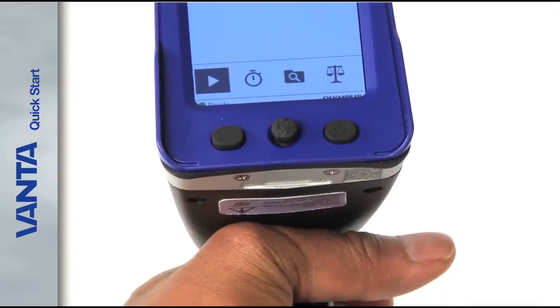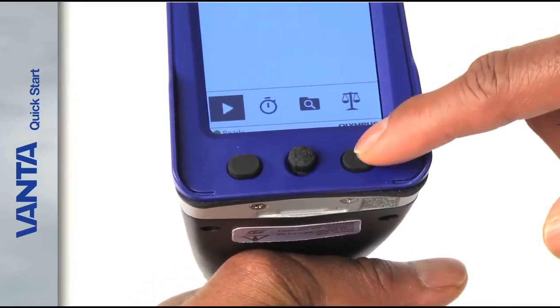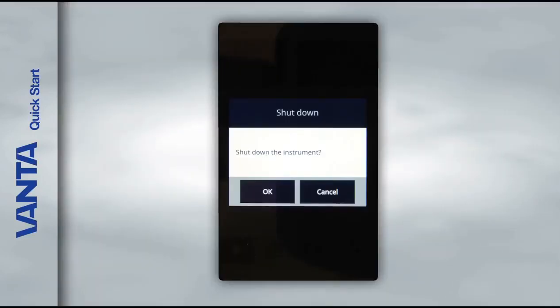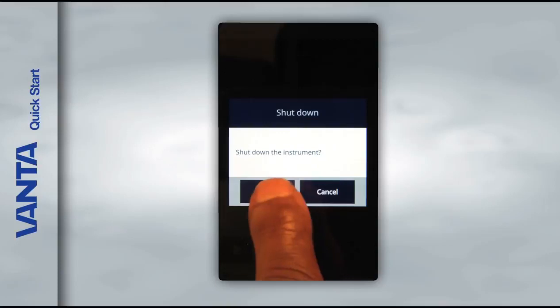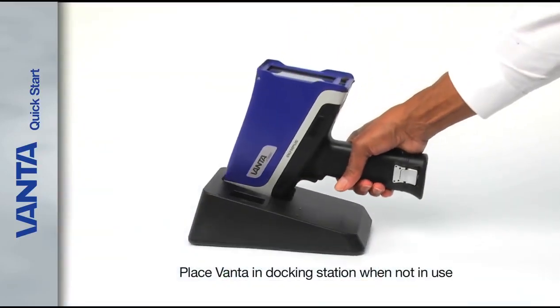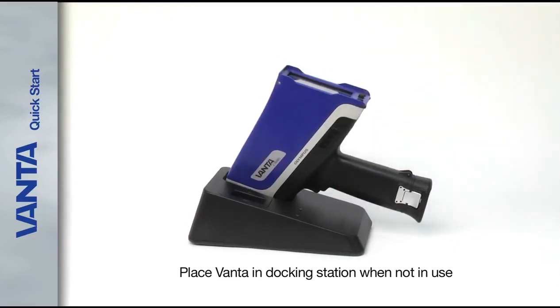When you are done using your analyzer, press and hold the power button for one second. In the dialog box that appears, tap OK to power off the analyzer. Place your Vanta in the docking station when not in use for safe storage.